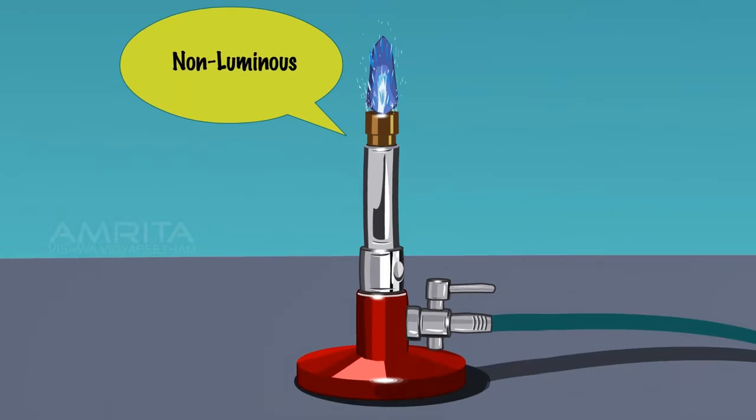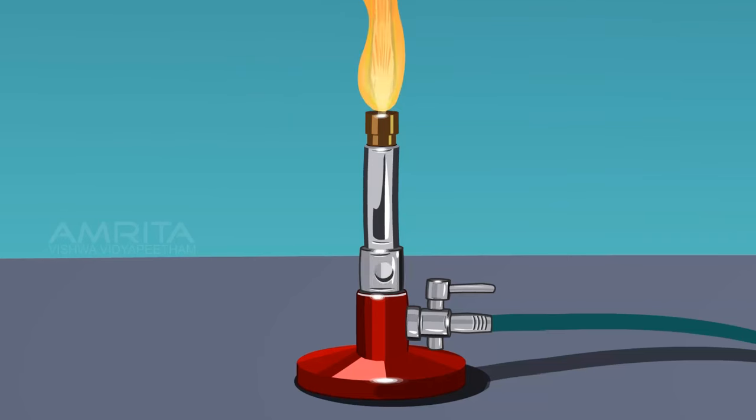A non-luminous flame is produced. On closing the air hole of the burner by rotating the air-adjusting disc, a luminous flame is produced. On opening the air hole of the burner, a non-luminous flame is produced.